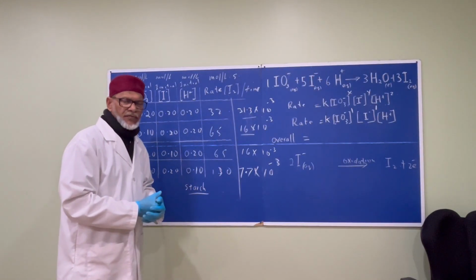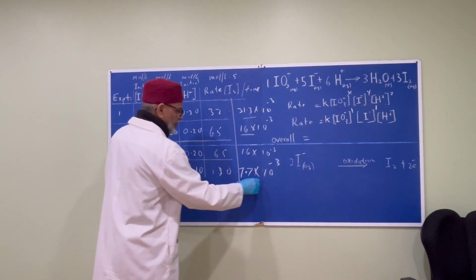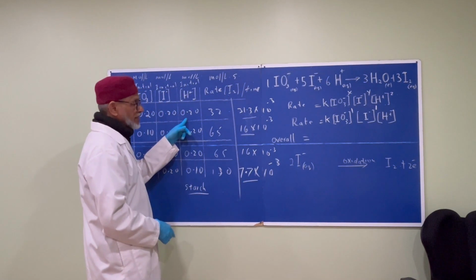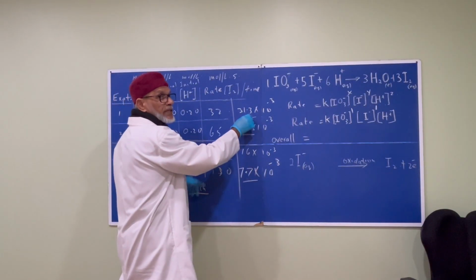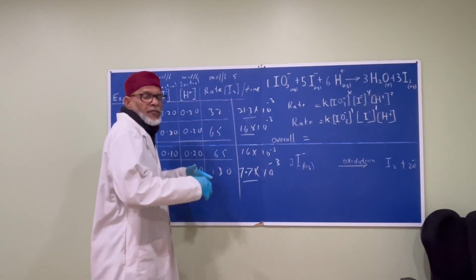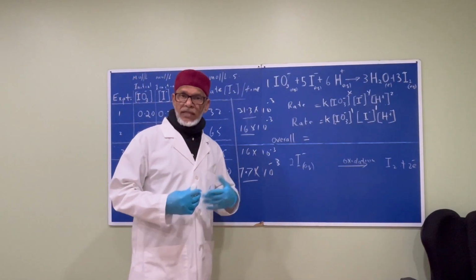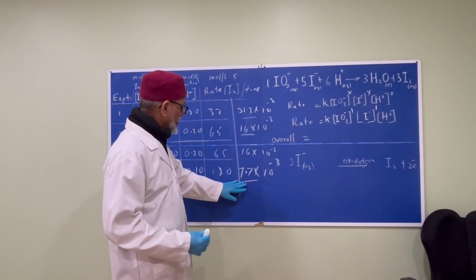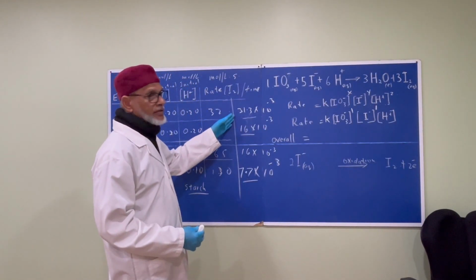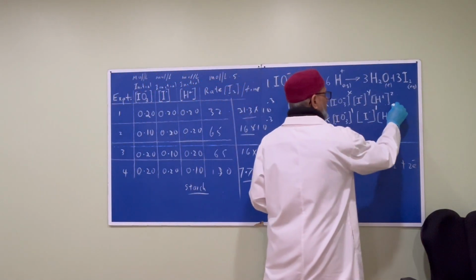But let's look at it for hydrogen. When we had that concentration, that was the rate. When we double the concentration, look, nearly 4 times, the rate quadruples. I mean, of course, we're not very accurate here, okay? We don't have the technology to do these things with precision, but we can see a trend. As you double the concentration of the hydrogen ions, the rate becomes 4 times more. And in such a case, we say that it has a rate order of 2.